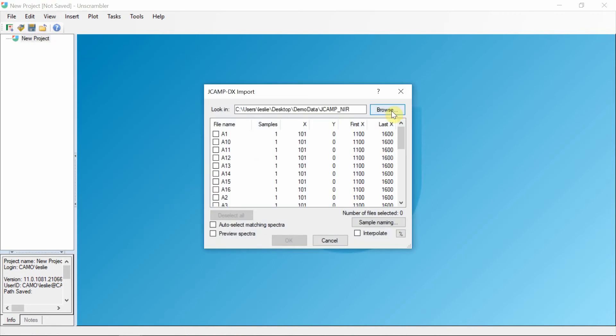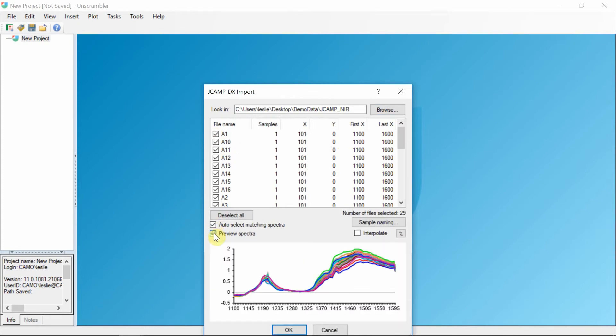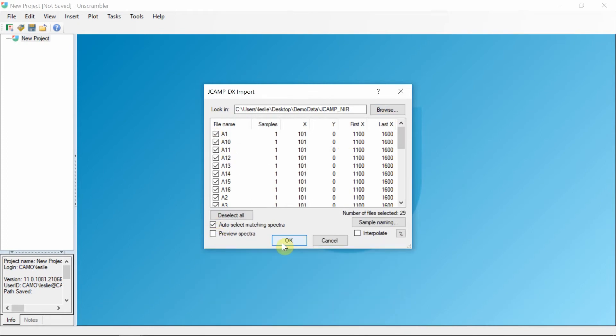Let's browse to the location of your spectra. Select, preview and import.